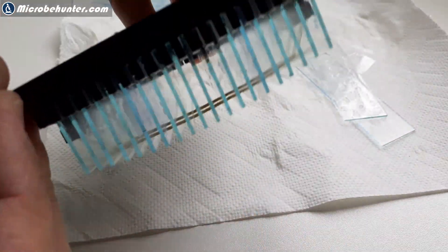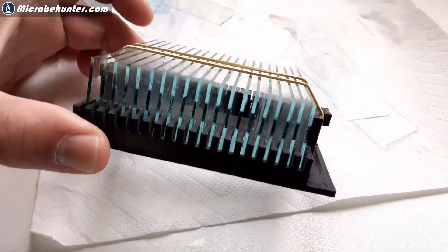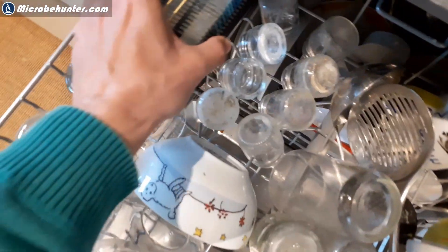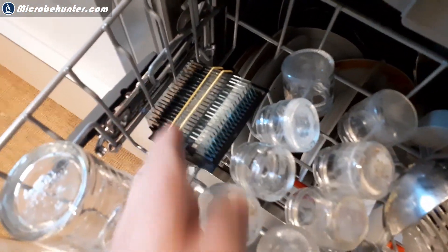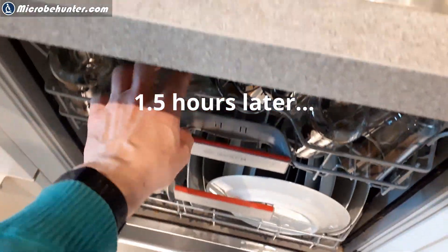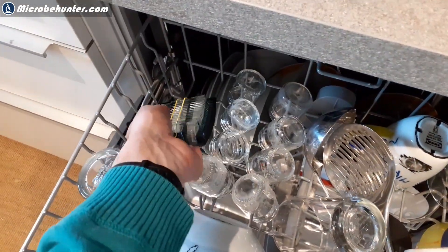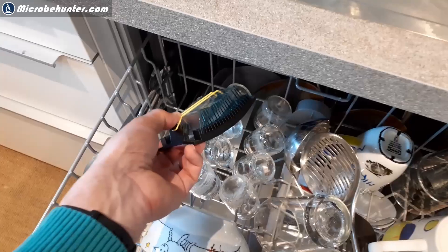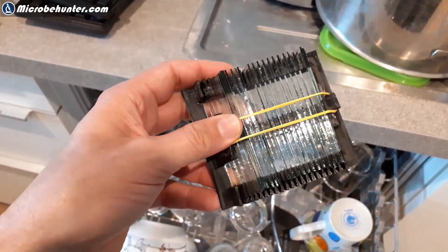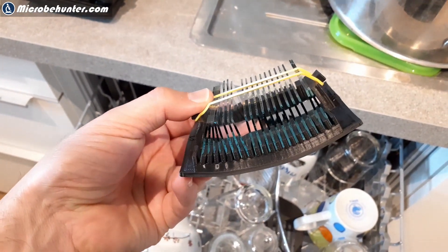I simply used a rubber band to hold everything down because I did not want the slides to fall out during the dishwashing process, as there is a forceful water stream. I placed it directly next to my dishes and gave it a try. After approximately one and a half hours I inspected the slides and discovered that unfortunately the slide tray was not stable enough, the rubber band pulled everything together, and the heat of the dishwashing process deformed the tray.